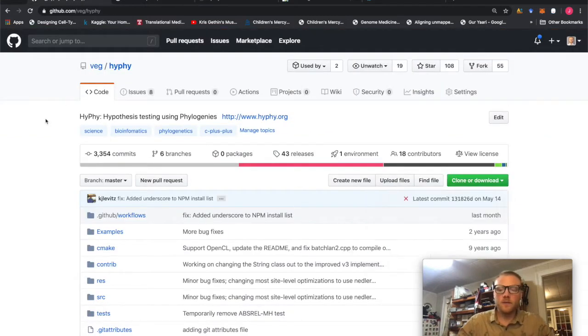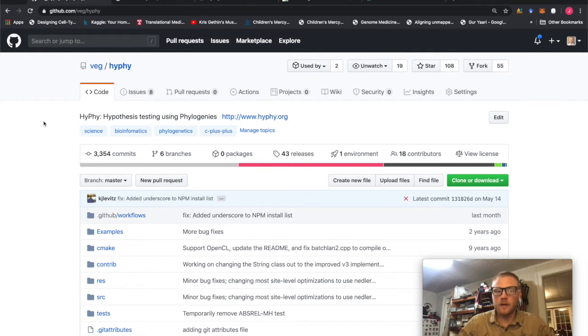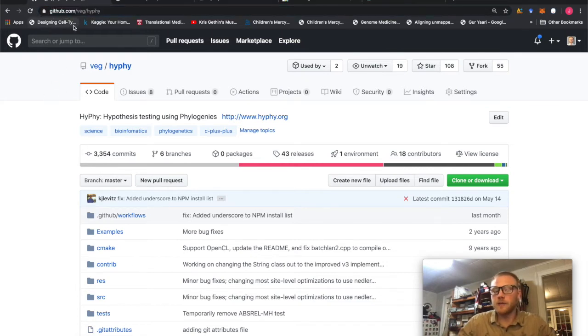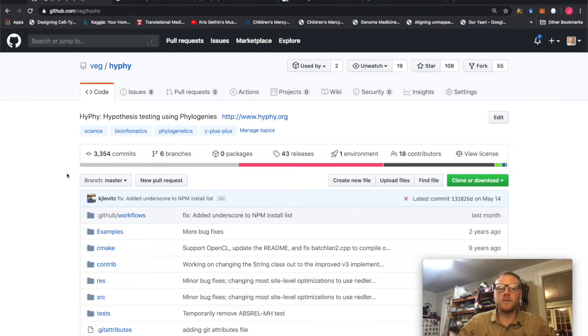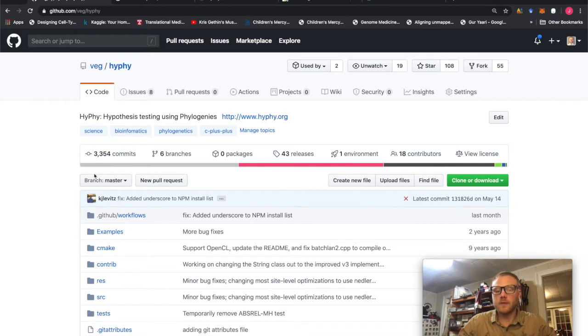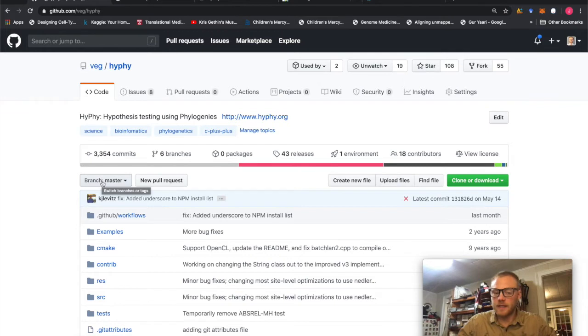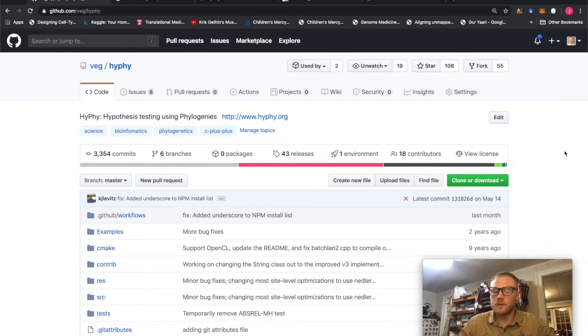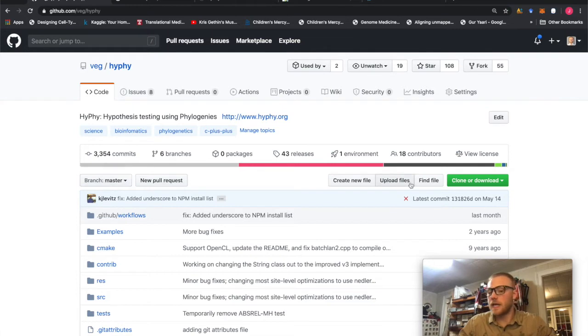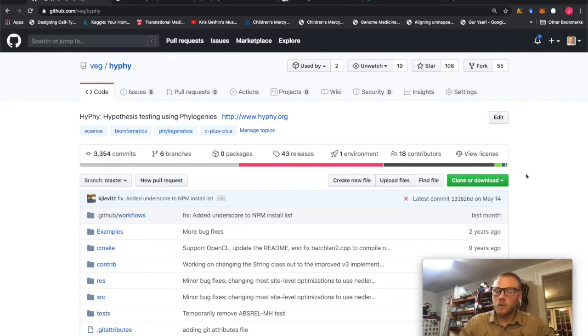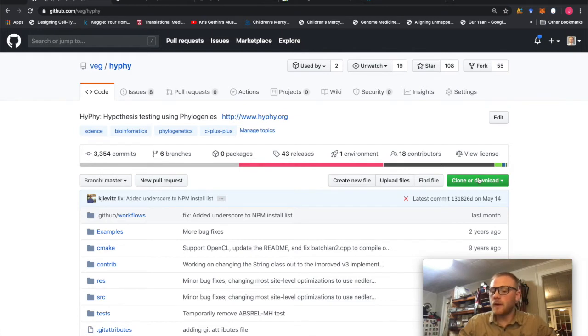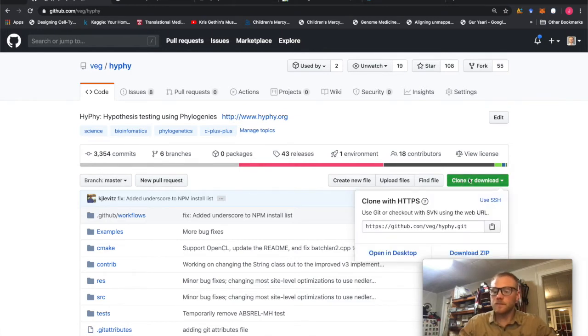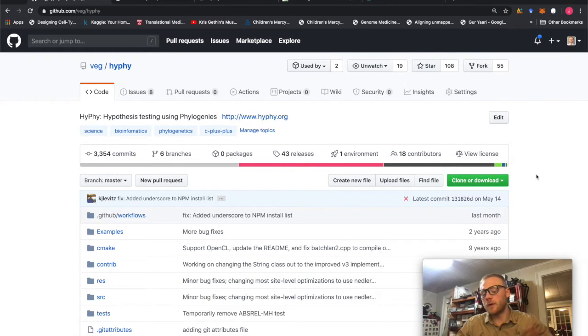So the first thing we're going to need to do is actually get the HyPhy software and it's on GitHub. As you see here, it's github.com forward slash veg forward slash HyPhy. And what we need to do is go right here. The first thing we can do is check this out.